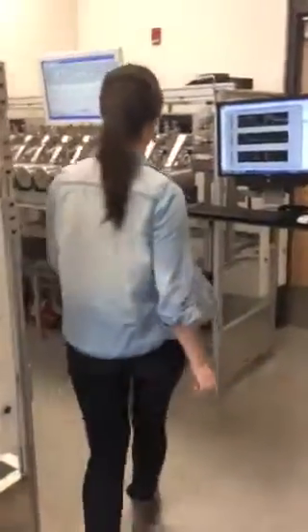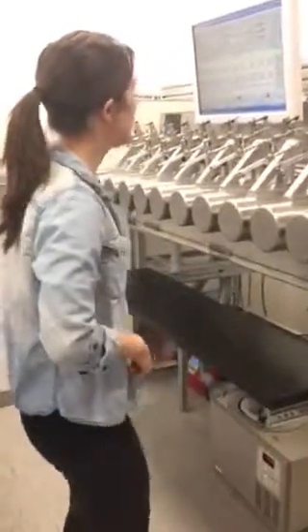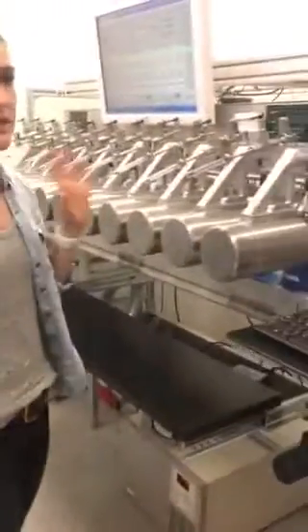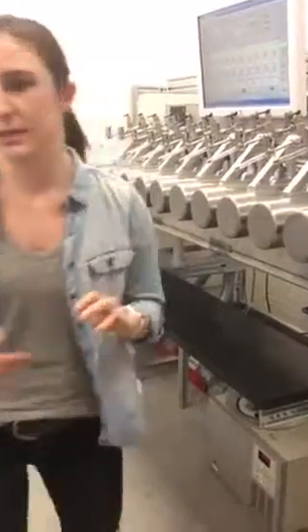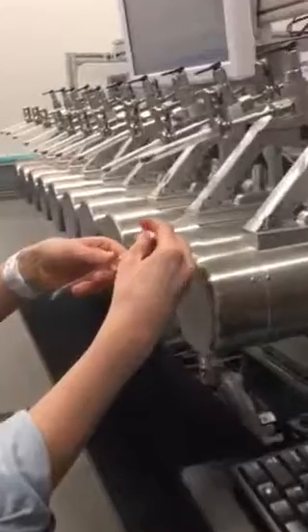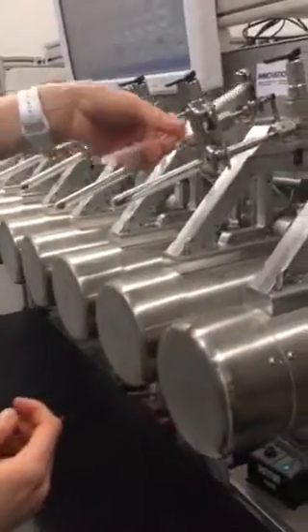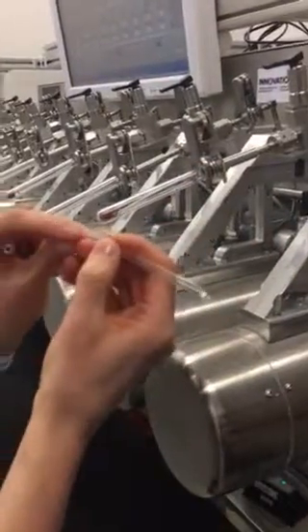So we have these custom designed graphitization lines, and basically what we're doing here is we're converting CO2 into elemental carbon. So we have our break seal. Just imagine this is together. And we load the break seal of CO2 into this section of the line. We've put a little etch on the glass there. And then what we do is we just go like this, and then it pops open the CO2, and then the CO2 can go into the system.